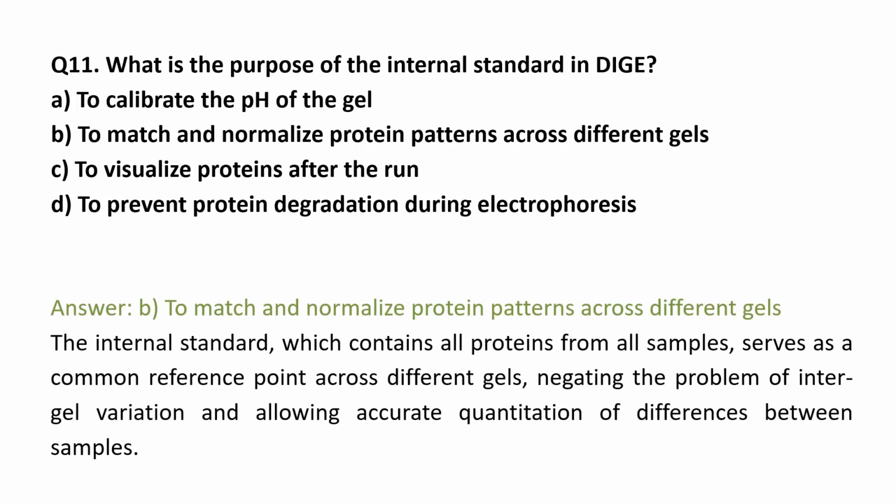So the answer is to match and normalize protein patterns across different gels. The internal standard, which contains all proteins from all samples, serves as a common reference point across different gels, negating the problem of intergel variation and allowing accurate quantitation of differences between samples.